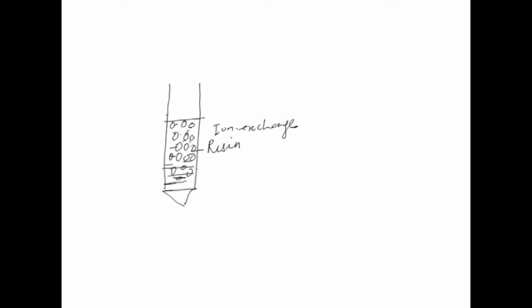Now, what you will do is, there are two ways: through a peristaltic pump, as we were discussing in earlier lectures, or you can manually load the sample. If I have to manually load the sample, I can load it with a micro pipette.